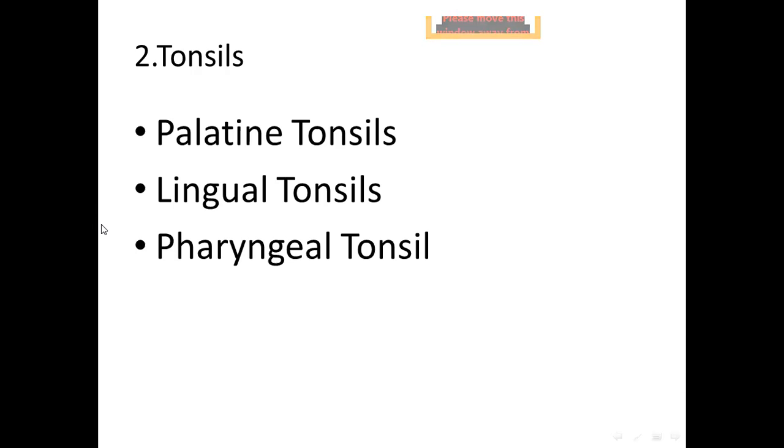Collectively they form a whole ring. They are incompletely encapsulated, an aggregation of lymphoid nodules, many with a germinal center and others without this center. It's primary.